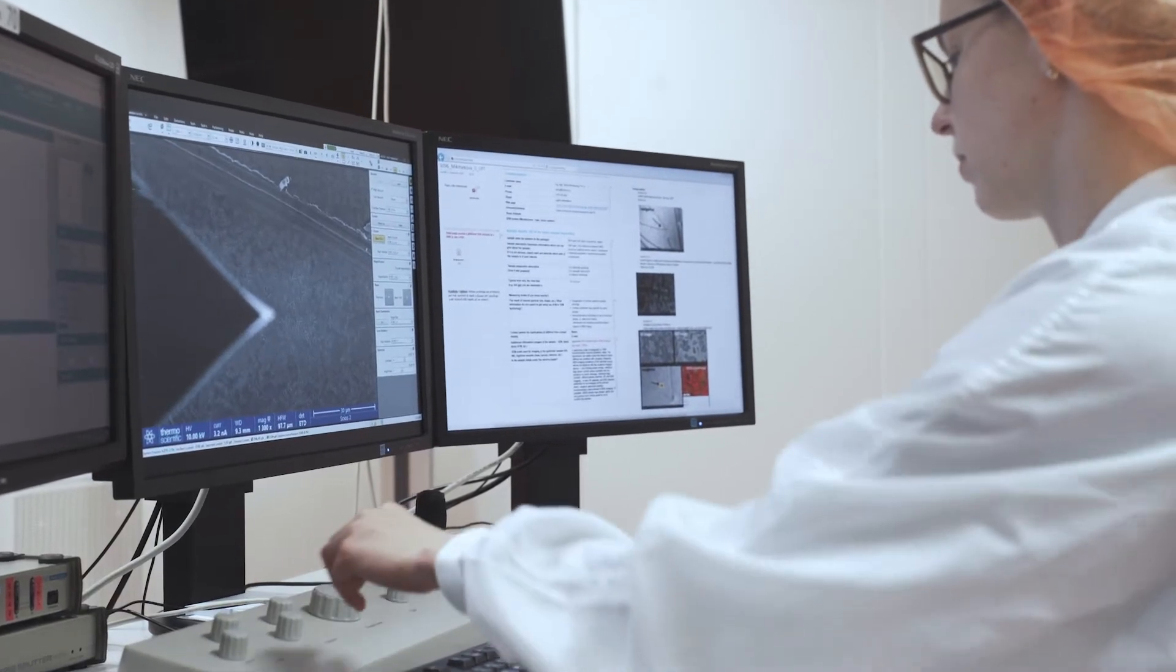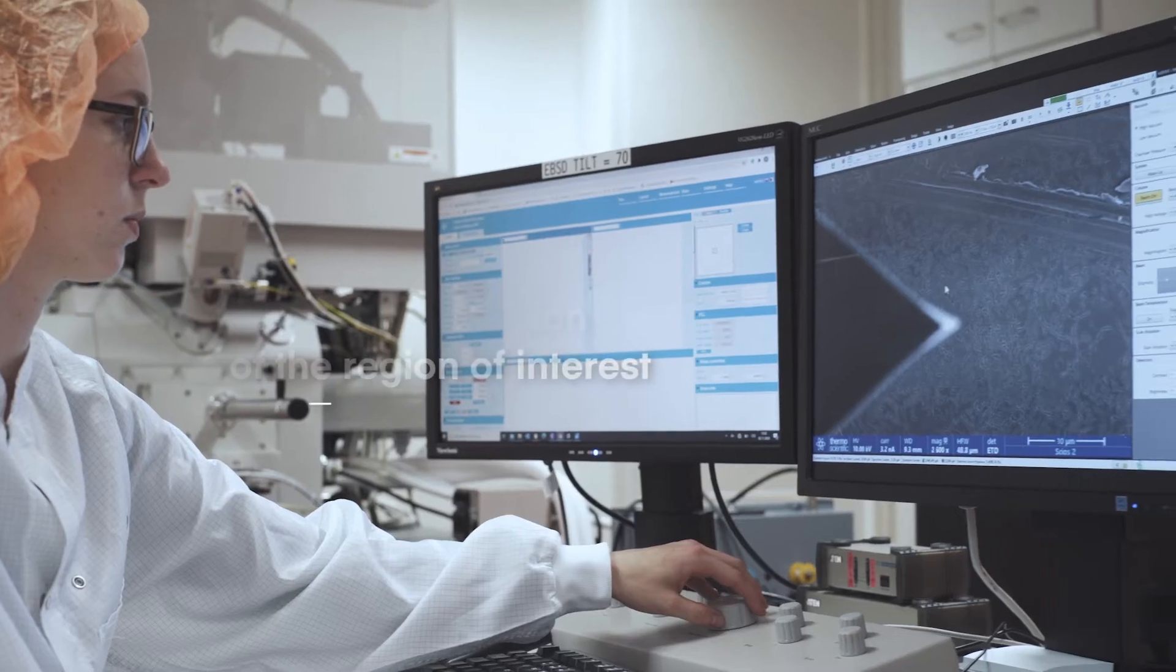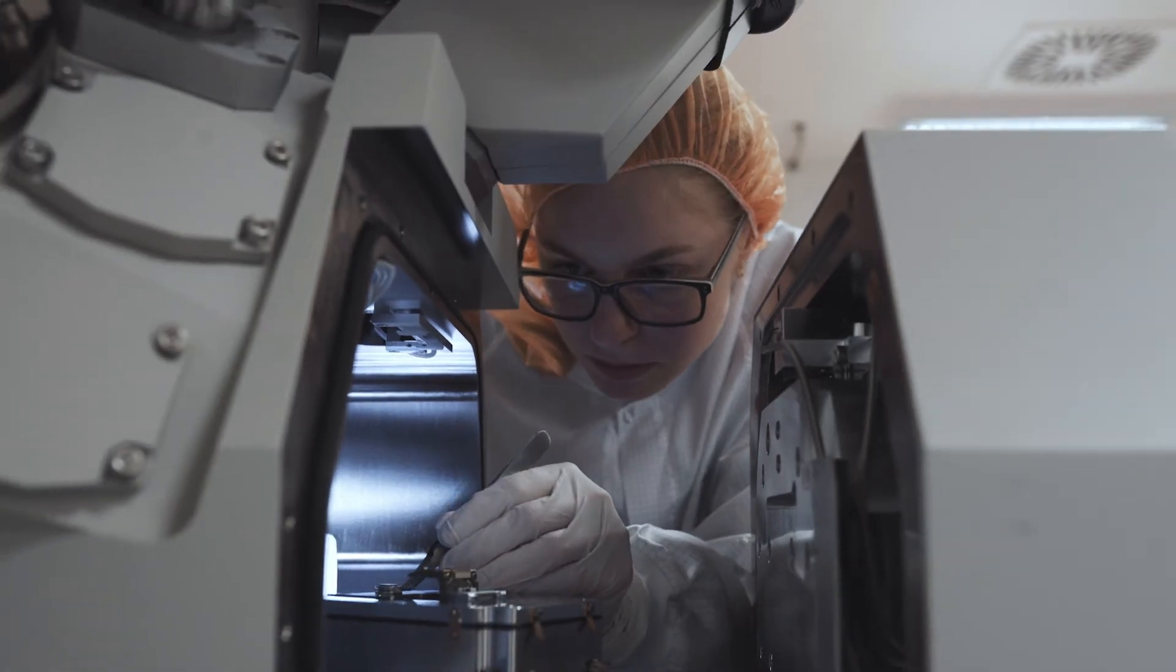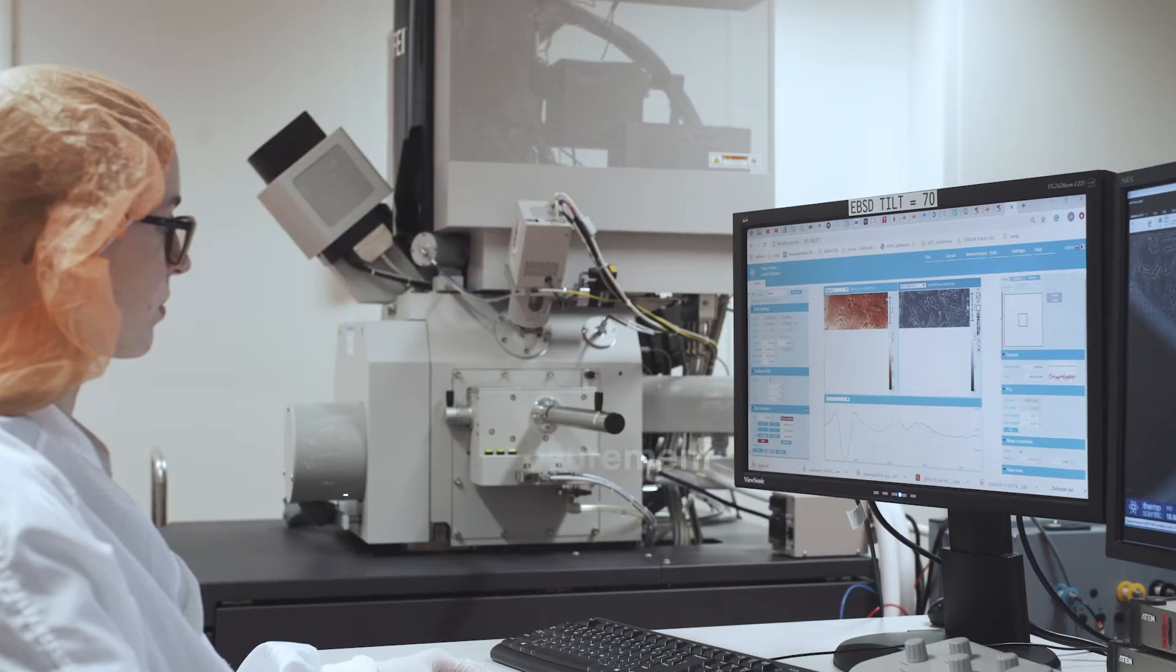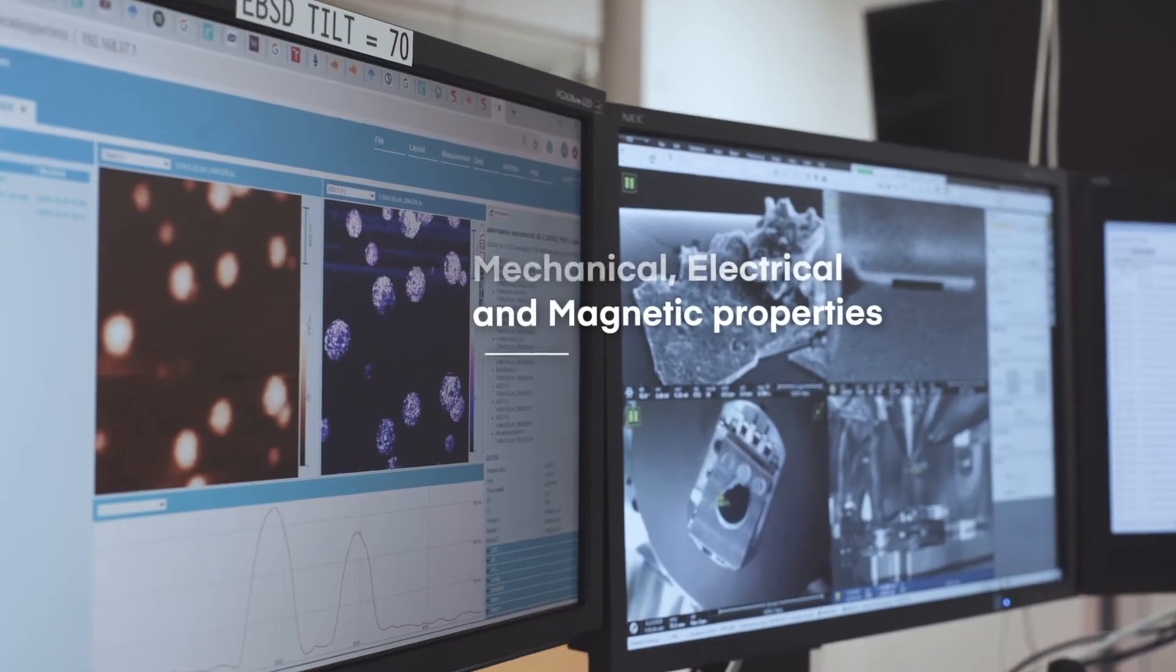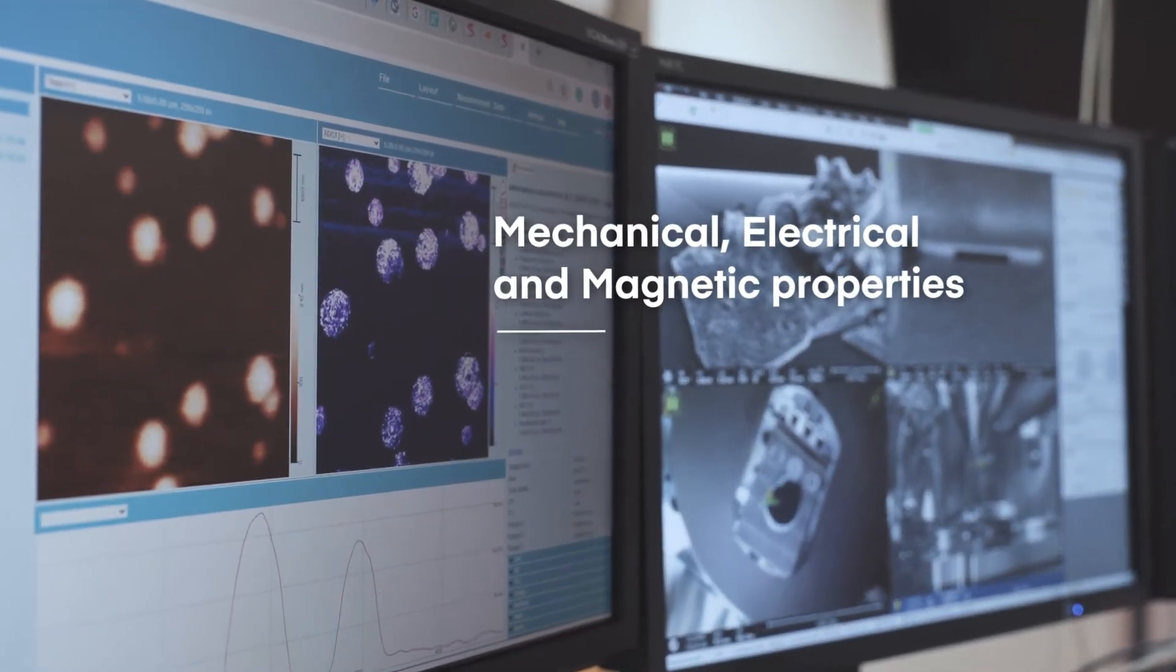LightScope enables precise localization of the region of interest and AFM tip navigation. It extends the capabilities of SEM by measuring sub-nanometer topography together with mechanical, electrical, and magnetic properties of the sample.